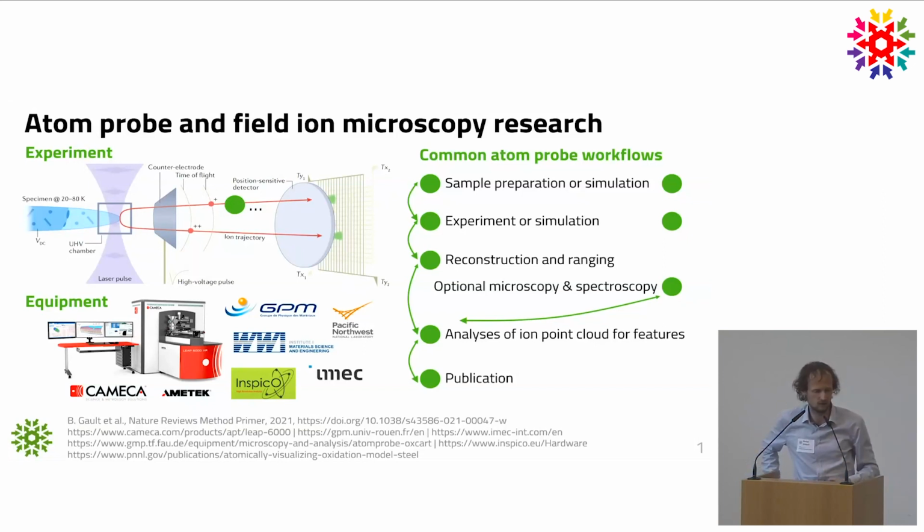Ideally we want a system where we can find well-documented data artifacts, with breadcrumbs along which we can follow the trajectory and time history of the project, so that we can learn what has happened, and ideally at some point also share the data sets across labs. That's exactly what NOMAD Oasis is, I think one of the most sophisticated solutions out there at the moment that couples these, without me as a software developer having to implement all this from scratch.